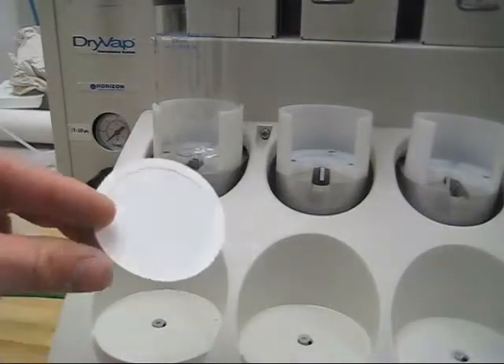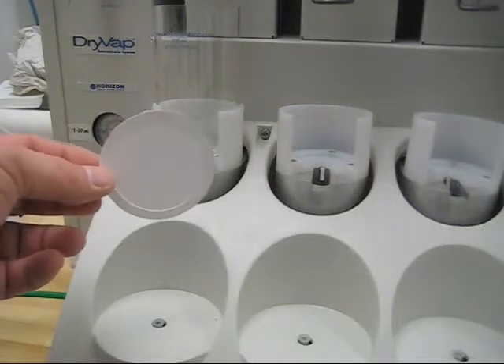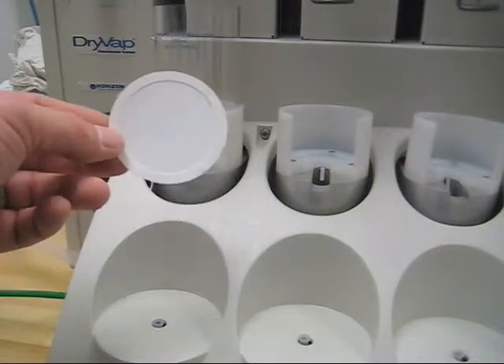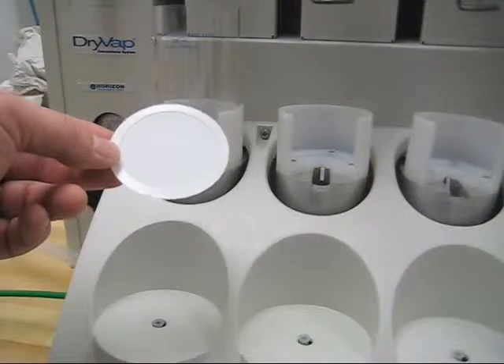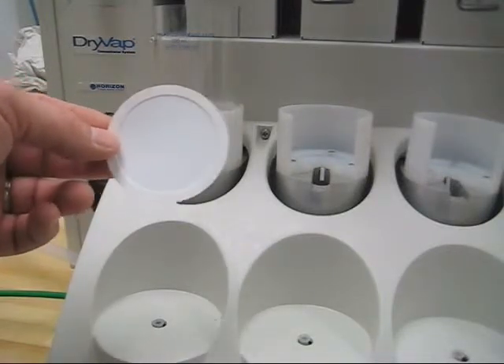These dry disks are reusable. Typically, customers will do a quick wash of the dry disk itself with some methylene chloride. Generally speaking, they can get about three or four uses out of one of these dry disks.